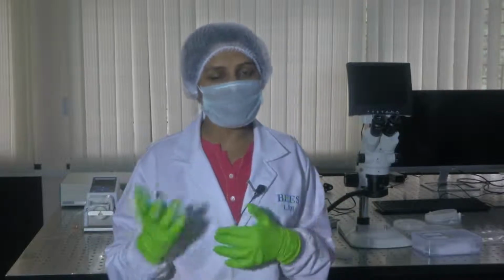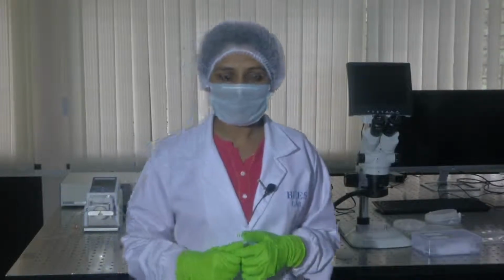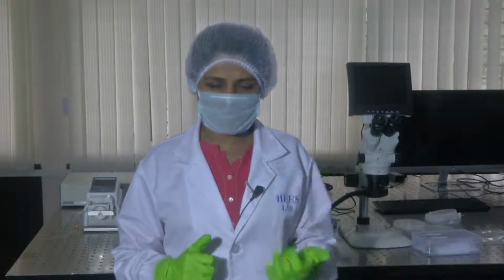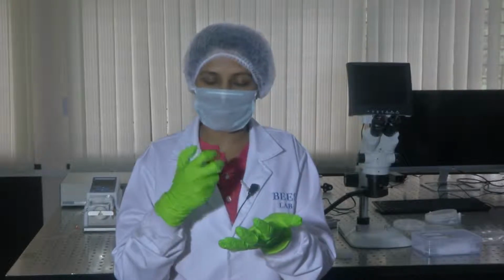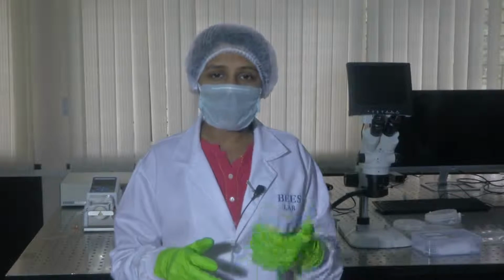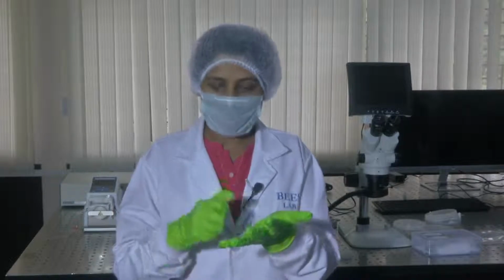You can look online at how a micro pump can be fabricated using PDMS. The most important requirements for us, if we want to precisely control fluid flowing through microchannels, are long term stability, repeatability, and fine control over them.